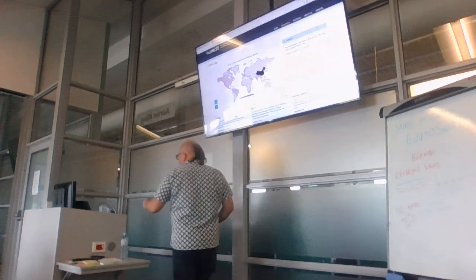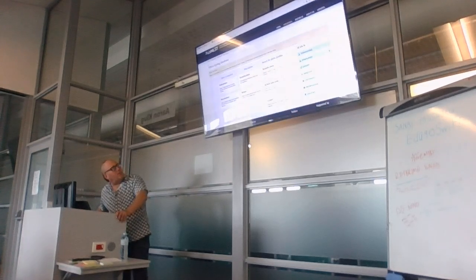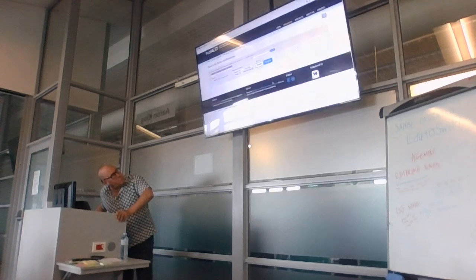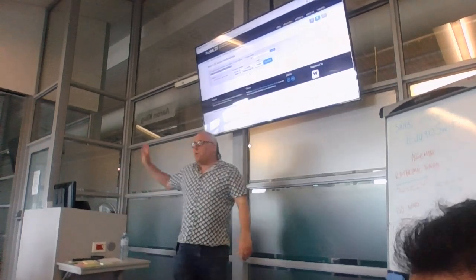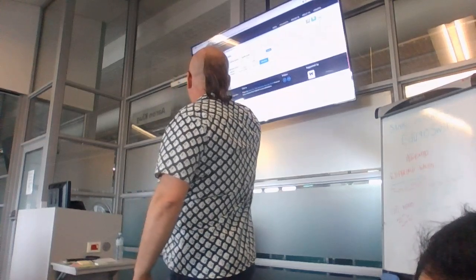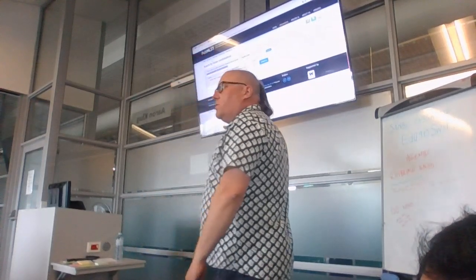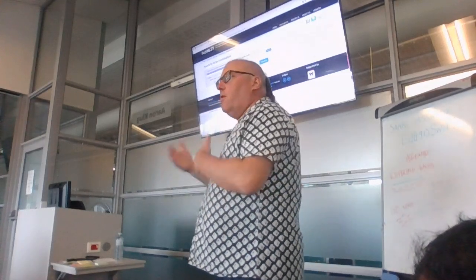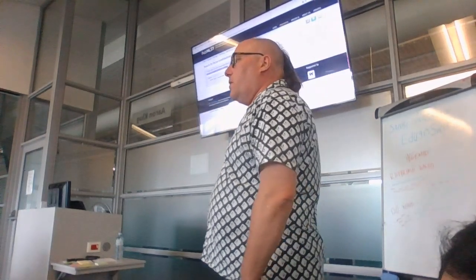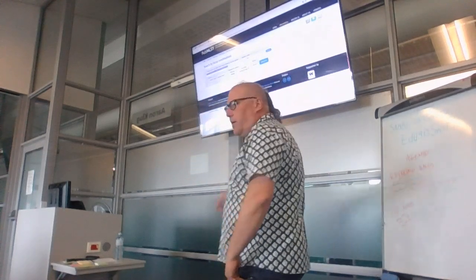And if we look at typing, and if we're just using MLST, not cgMLST, then we get asked for gyrB, pyrH, recA, and atpA, okay? These are the marker genes for Vibrio species. And then we can look at what alleles we have, translate them into allele numbers at those positions, and from there we get a sequence type, an ST, okay?